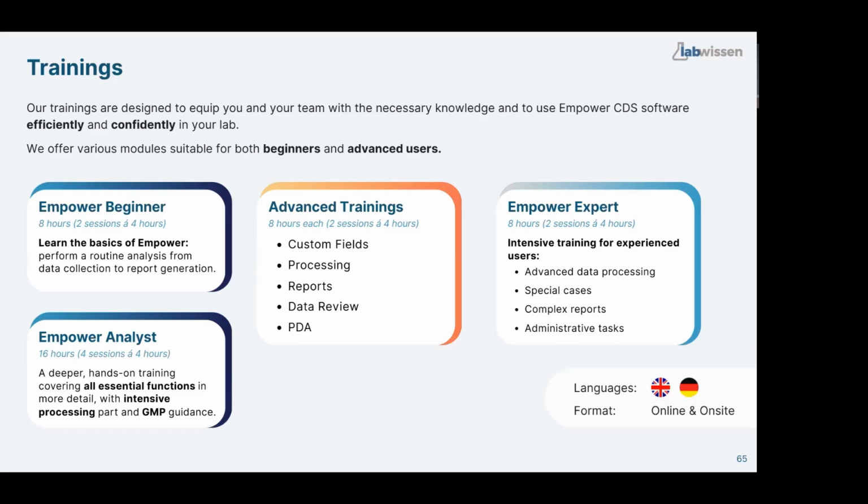And online trainings are not like the webinar, where you're just sitting and watching. It's more that you're working with me in your Empower. We work with your project, with your data. It's more interactive, because learning Empower by only watching for one day, 8 hours, I think you will not learn anything from it. So I do trainings in an interactive format, with quizzes and tasks, so you really work with me in Empower.